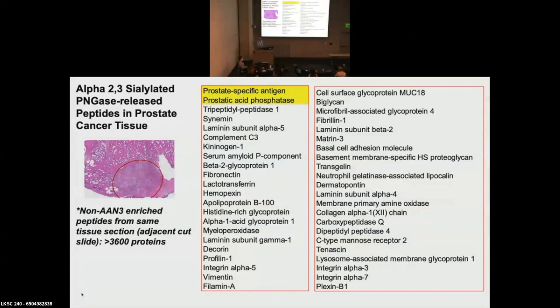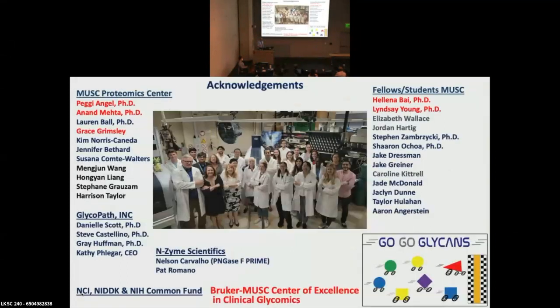And if you're using antibodies, whether it's MALDI IHC or MIBI-TOF, well, this might be a new list. So we like this where you can just feed all this information back and start working with all these other approaches that we've been talking about to even just home in closer and closer and closer. So that's where I'll stop.